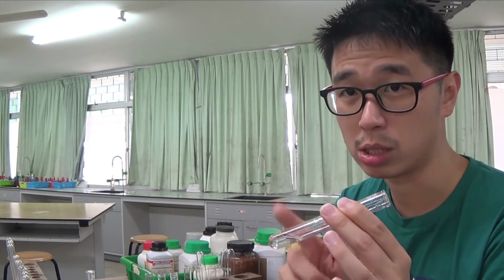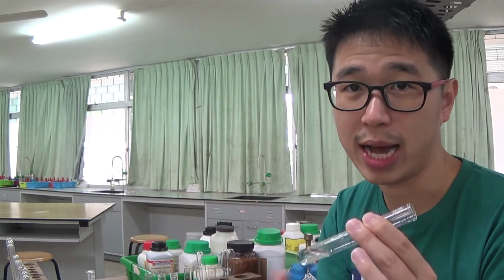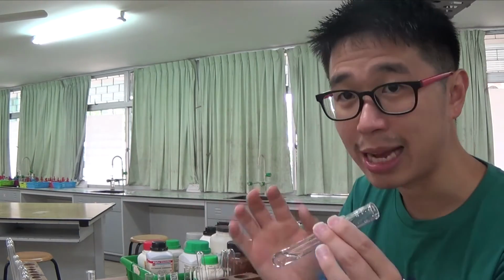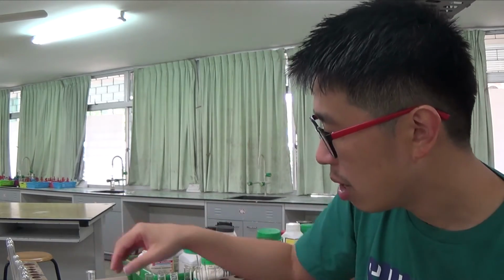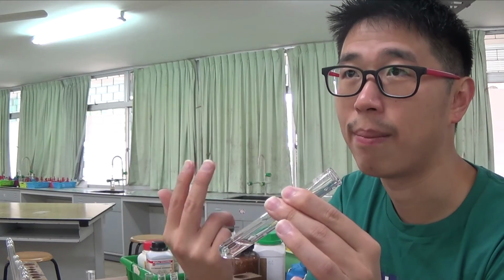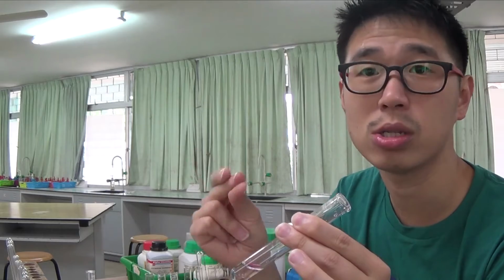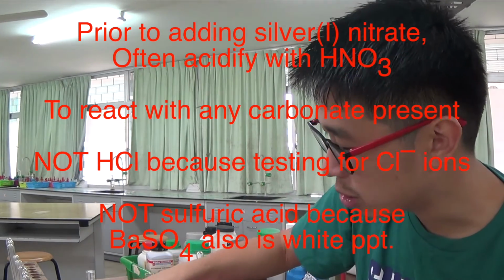Remember, we knew what the solid was. We knew what the solution contained. But I just want to show you that it gives a negative result with the other ions that we are testing. Carbonate down. After I added some nitric acid and there is no effervescence, no carbonate, with the nitric acid in there, that's why they say acidify with some dilute nitric acid. You can only use nitric acid. Acidify with nitric acid, then you add silver nitrate.